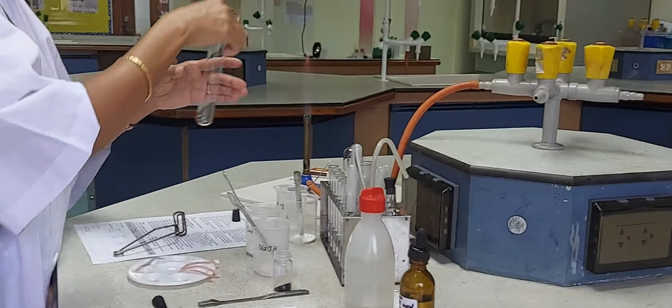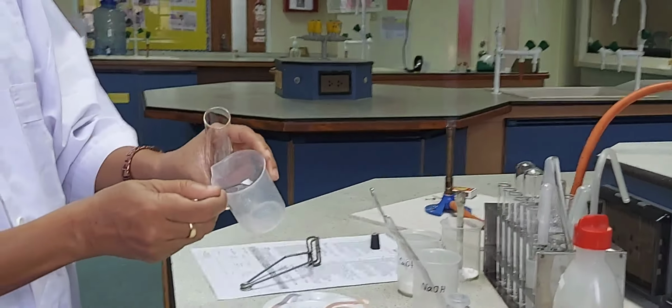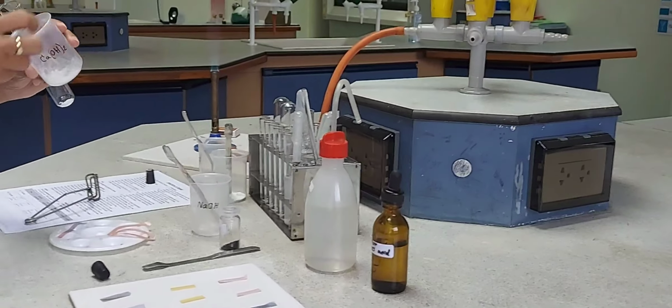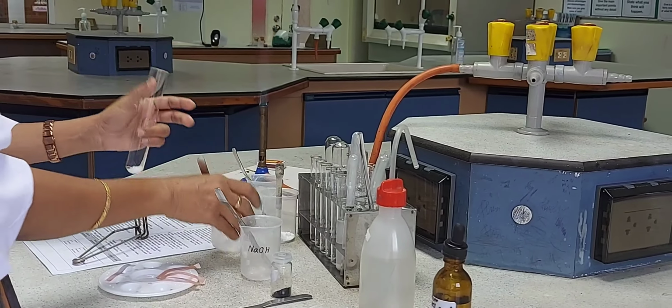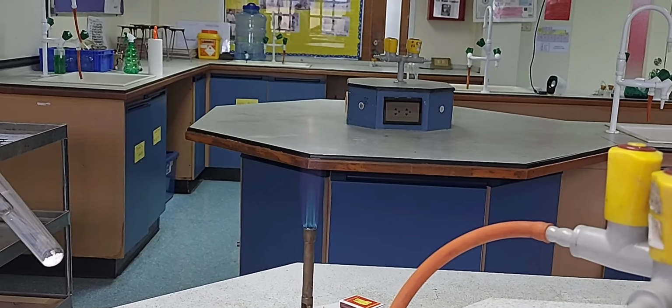To the next boiling tube, I will add ammonium chloride, a spatula measure, and take a spatula measure of calcium hydroxide and heat it gently. And if there is any gas being evolved, I am going to test it with a red litmus paper.